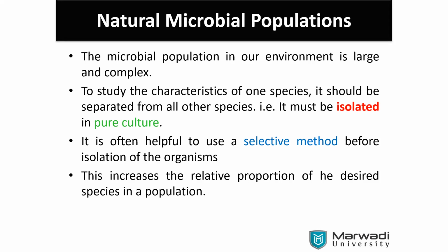Other than that, there is one particular situation where microbial populations will be there. I have taken a few examples related to it. Some bacterial populations are causing the diarrhea, and we want to check whether this organism is there in the stool or not. It is really difficult because our stool has normal flora in it. So when you take some sample from it and culture it, our normal flora will grow fluidly. So we need to control them. It must be controlled, then only it's easier for us.